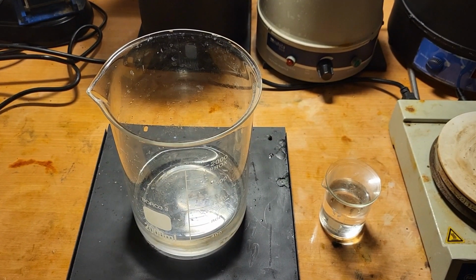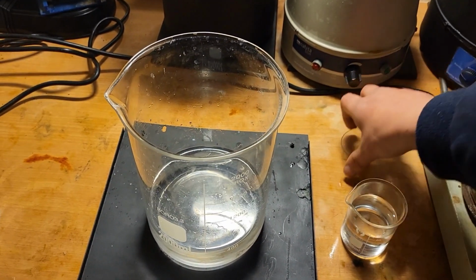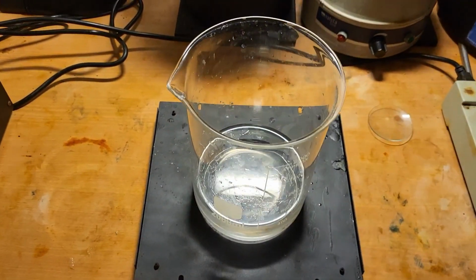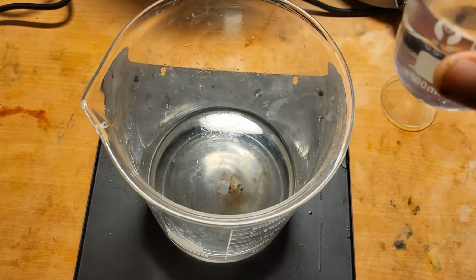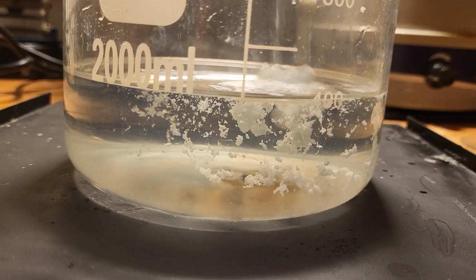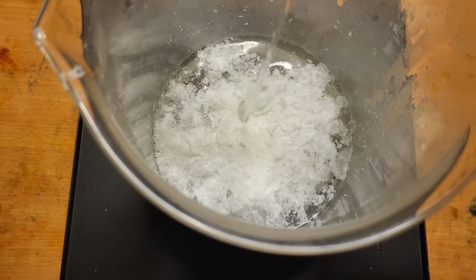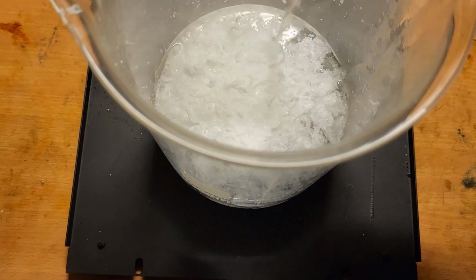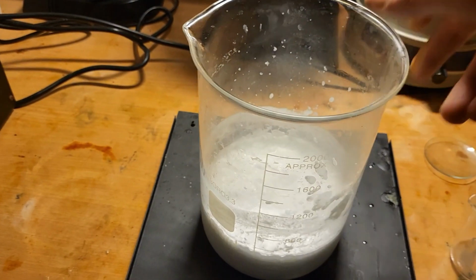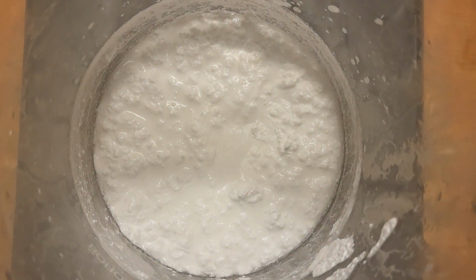Now that the sodium benzoate is all dissolved, we can start to add the hydrochloric acid. This will precipitate crude benzoic acid, as you can see. There is our benzoic acid.